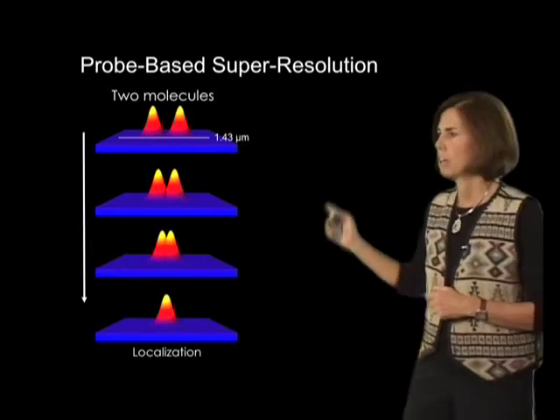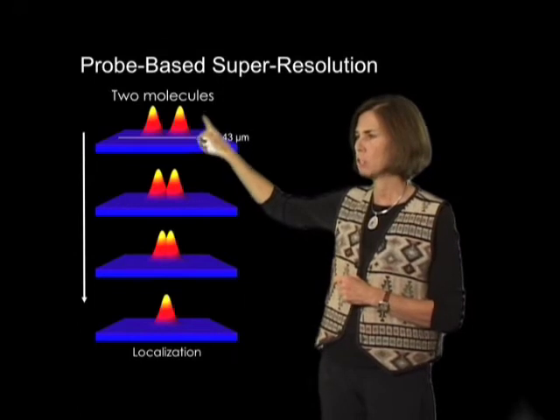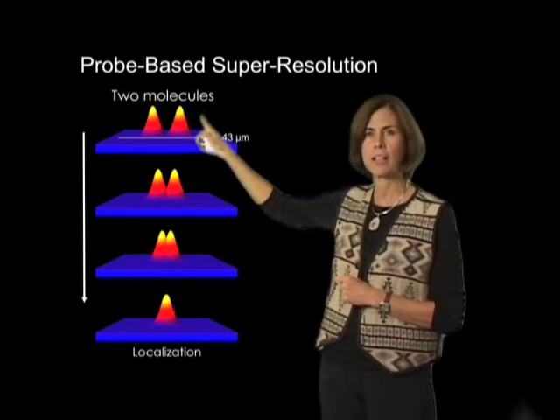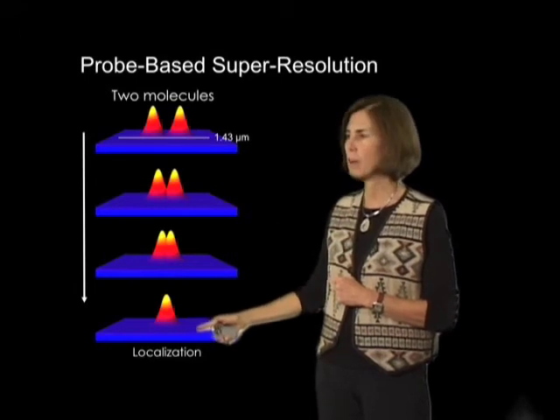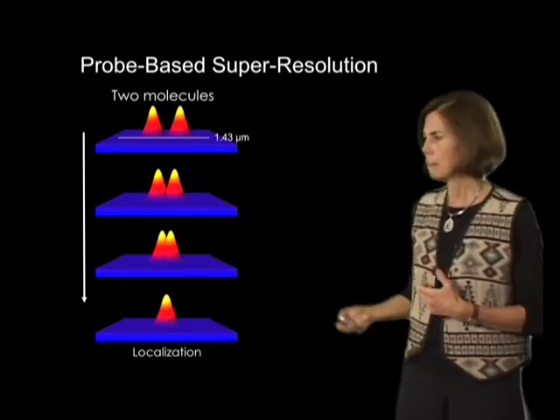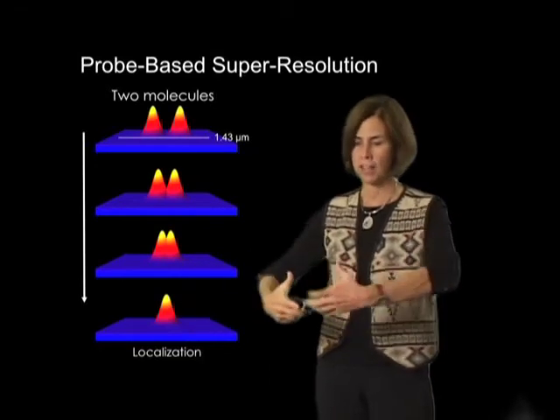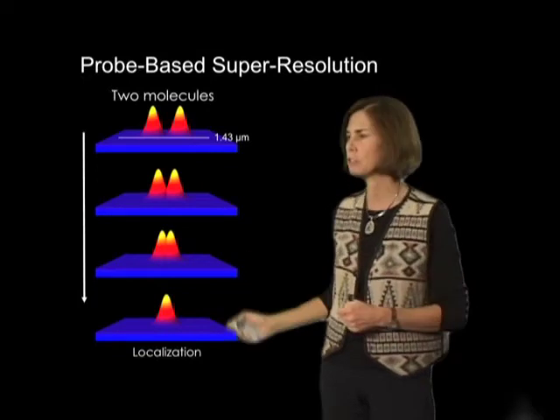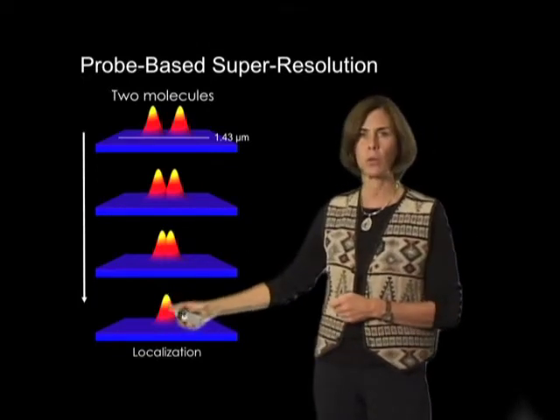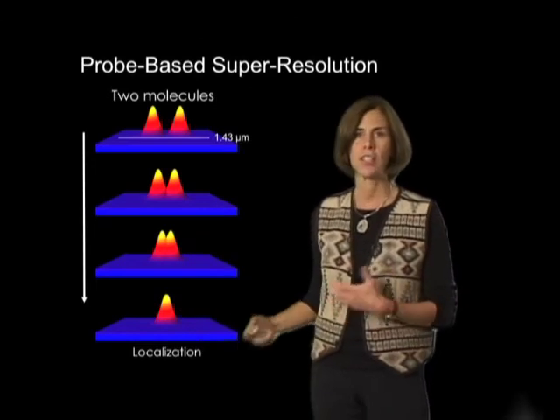This approach of fitting individual fluorescent probes using this kind of Gaussian fitting system falls apart under these conditions when you have many molecules, because you don't know whether in any particular PSF, which has a radius of anywhere between 200 to 400 nanometers, there's a single molecule or hundreds of molecules. So your localization is essentially lost through this approach.